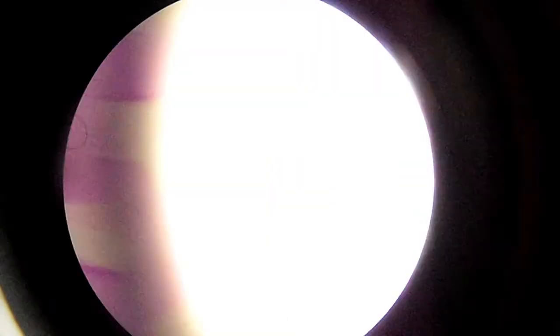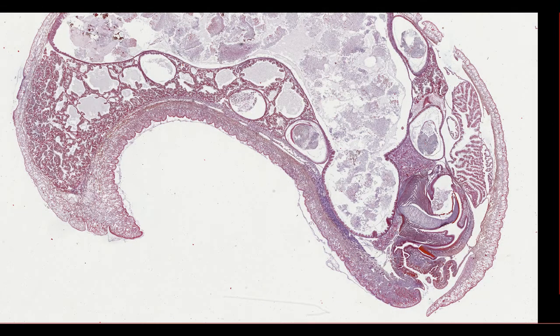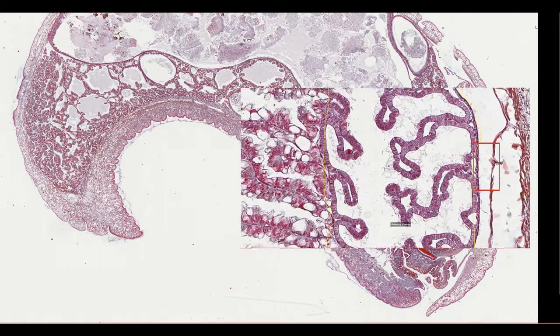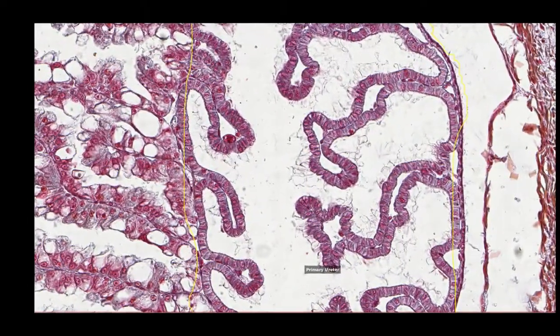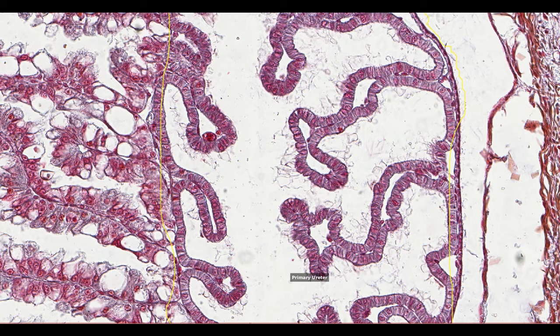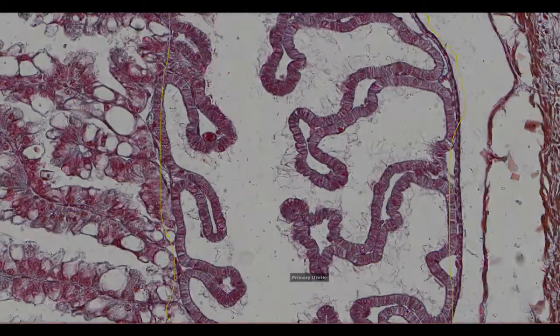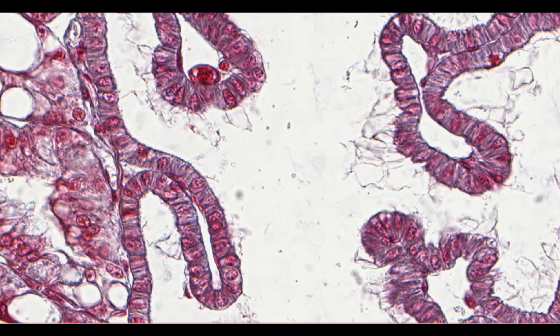Number five: reabsorption. Reabsorption of water and solutes does occur in the glandular kidney, but most of it happens further down the excretory system in the primary ureter. The ureter is lined by highly active cells and has slightly folded walls, so more cells can have contact with the lumen. The cells are lined by microvilli, also known as a brush border, giving a fuzzy appearance to the cell surface. These microvilli increase cell surface area, meaning more space for membrane channels and transporters involved in reabsorption.